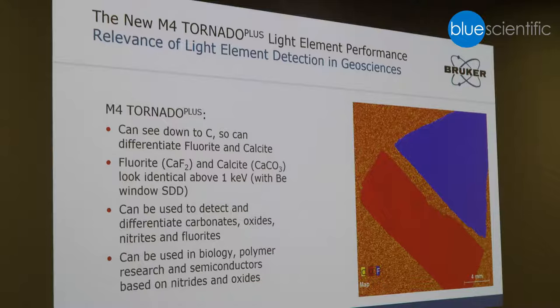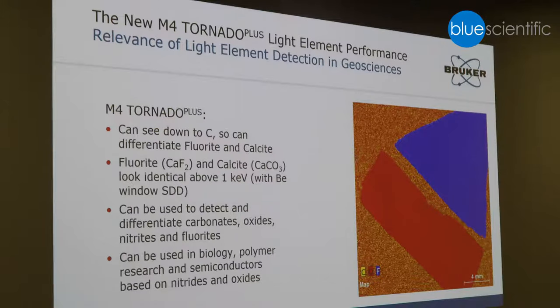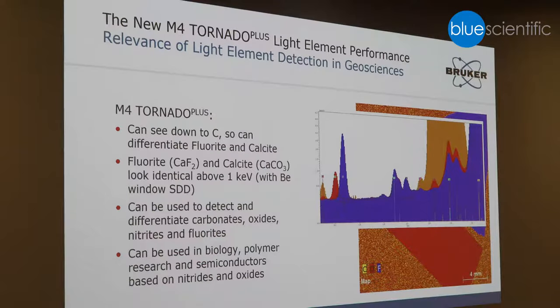This is proof that we can really analyze light elements. This is a mineralogic sample, and the motivation is to differentiate between fluorite and calcite. In the past this was quite difficult because fluorite is one of the key elements we couldn't detect. Here you can see the distribution of fluorite, oxygen, and carbon — the carbon here is in the background as it's a resin-embedded sample. In the spectrum you see the oxygen peak, the carbon peak, and the blue one is the fluorite. This can now be utilized for geological samples or any other samples where you want to analyze elements below the previous barrier of sodium.